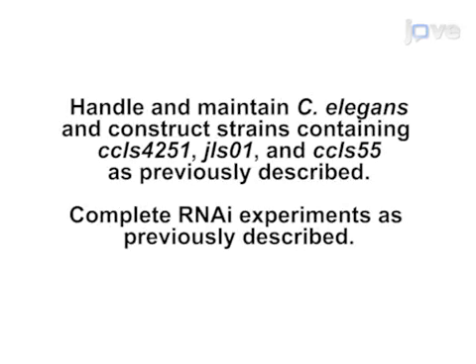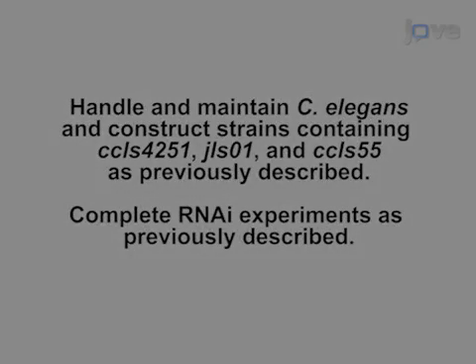Handle and maintain C. elegans and construct strains containing CCIS 4251.